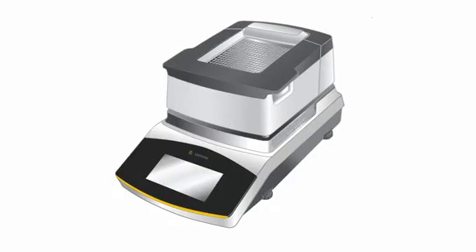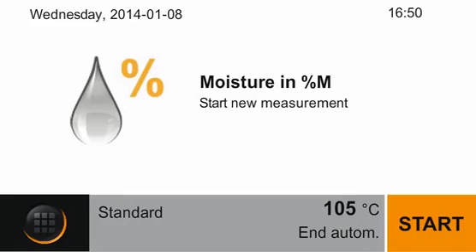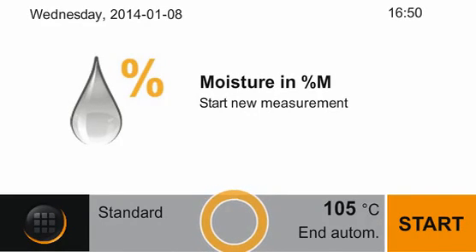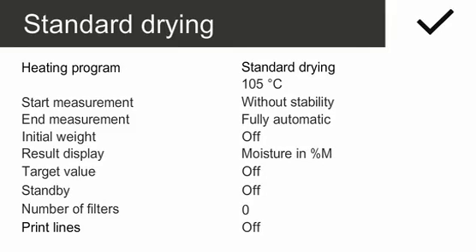Viewing and adjusting current parameters. Please tap on the function bar below. The current parameters are displayed. The parameters shown here are suitable for moisture determination on a variety of substances.